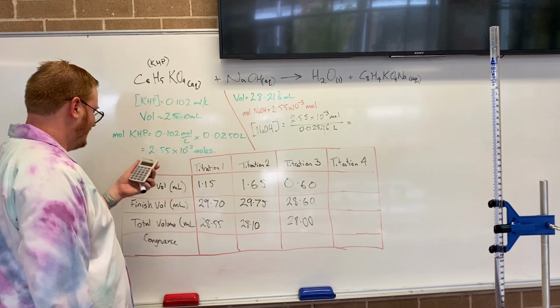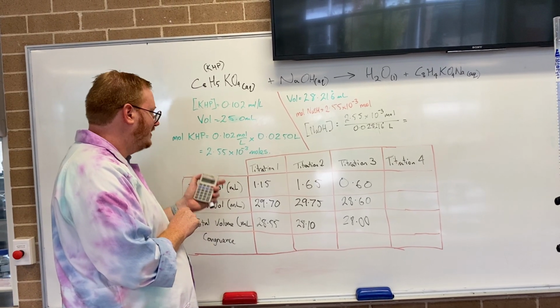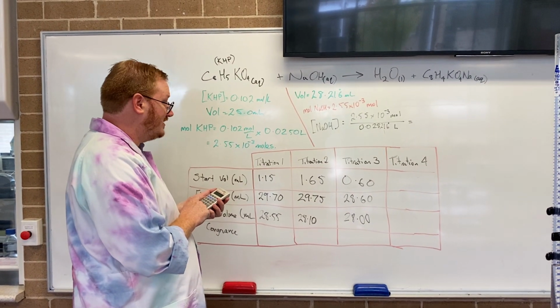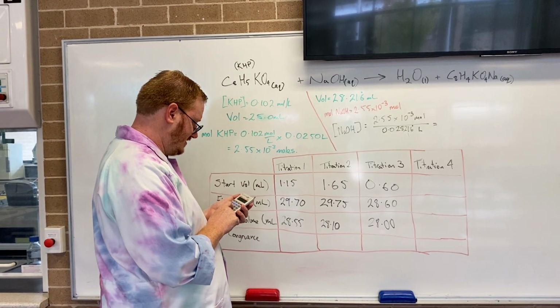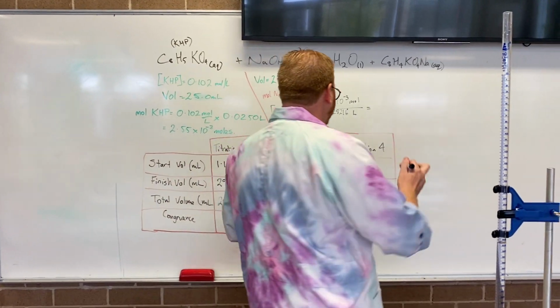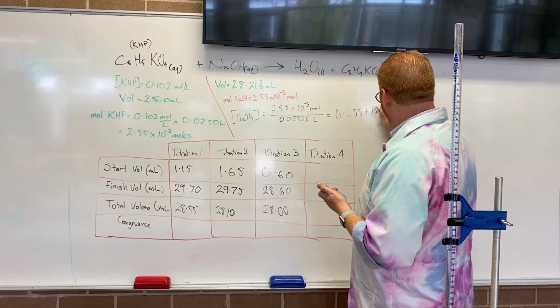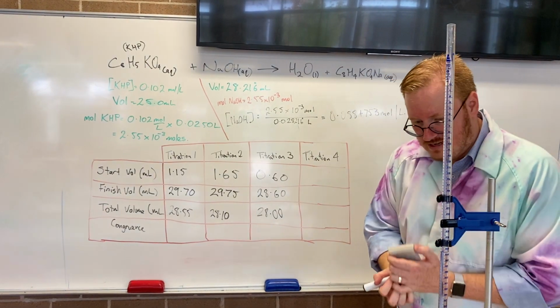Oh, I can't do, oh that's okay. I'm gonna have to convert my 2.55 times 10 to the negative 3 to 0.00255 and divided by 0.028216. Oh, that's all I can put in. That's okay. Okay. 0.0884753 moles per litre. That's not our final answer though.